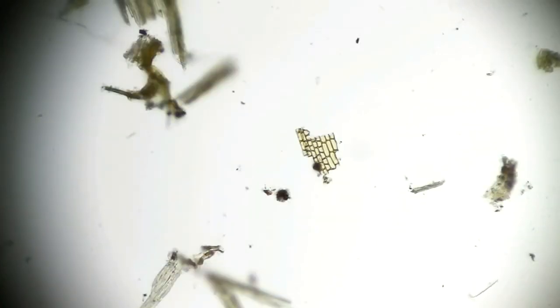I always see a lot of fragments like this, which is like a single cell layer of some plant material. If you did GCSE biology, you'll remember that animal cells look quite different from plant cells. Plant cells tend to be squarer, they've got an extra cell wall that makes them stronger. And when you see fragments like this, they tend to look like brickwork. They're just so regular and so incredibly different from kind of biological material.